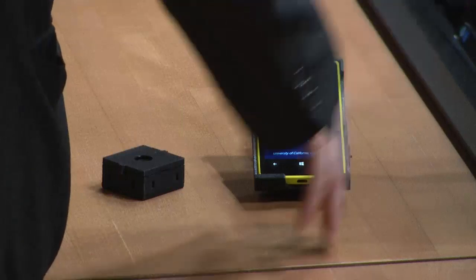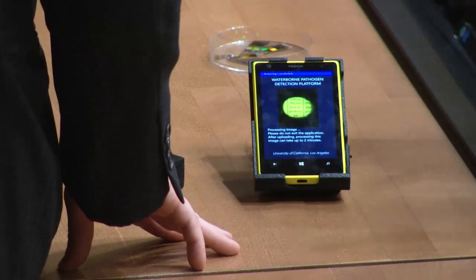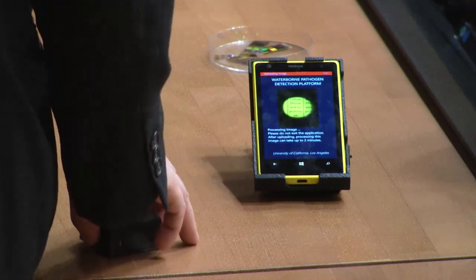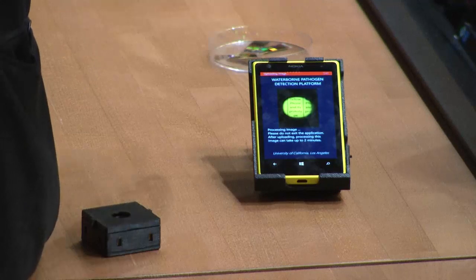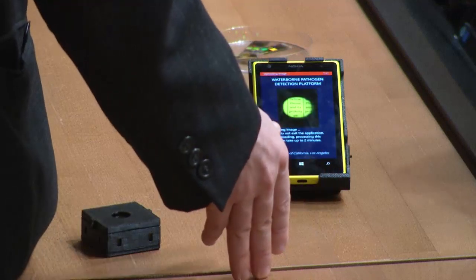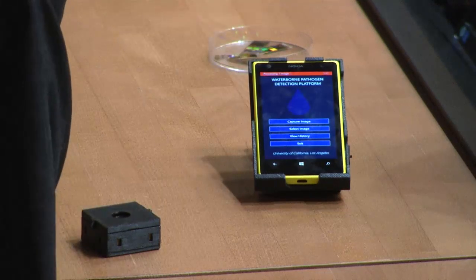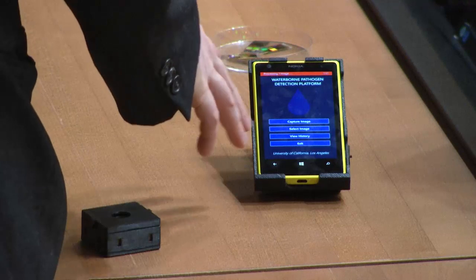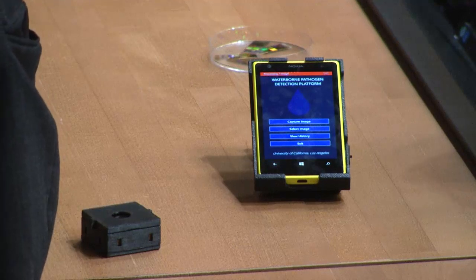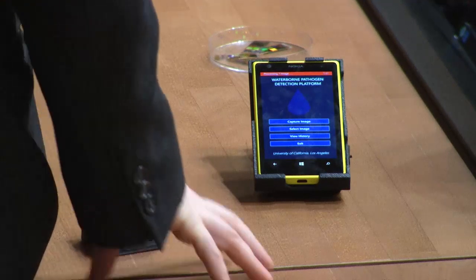Now the app is sending the image to our server, and the server will run the cyst count and send it back. It's very frustrating because when writing your own applications, Windows, Android, and Apple are very restrictive in controlling the camera parameters. Nokia is the only one that allows us to take raw images. So we actually use the basic camera application to do the image acquisition, and the app is for taking the image that's already stored on the phone, sending it, and receiving a diagnosis and adding whatever sort of information we want.